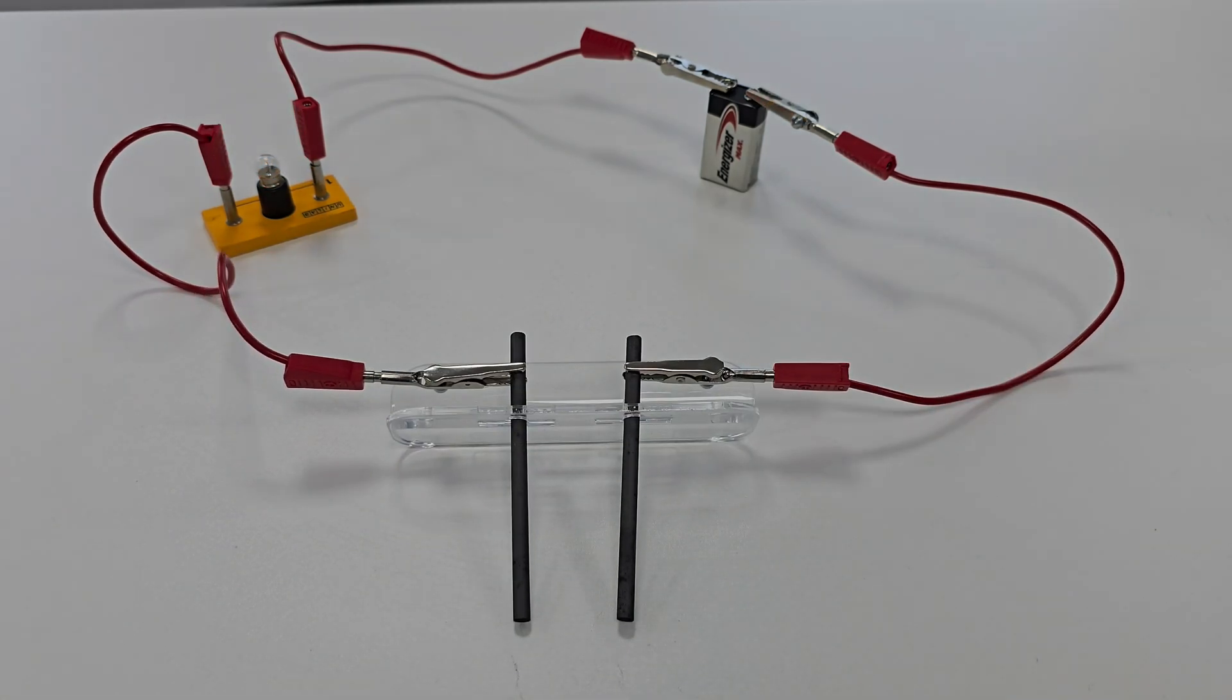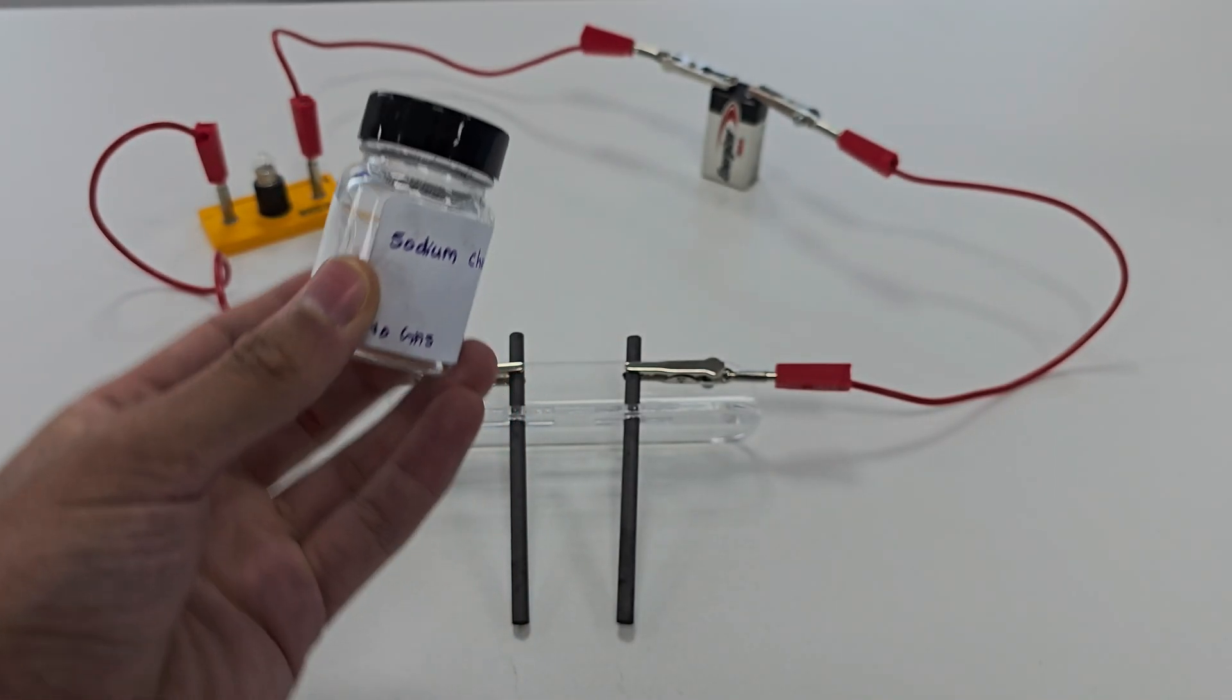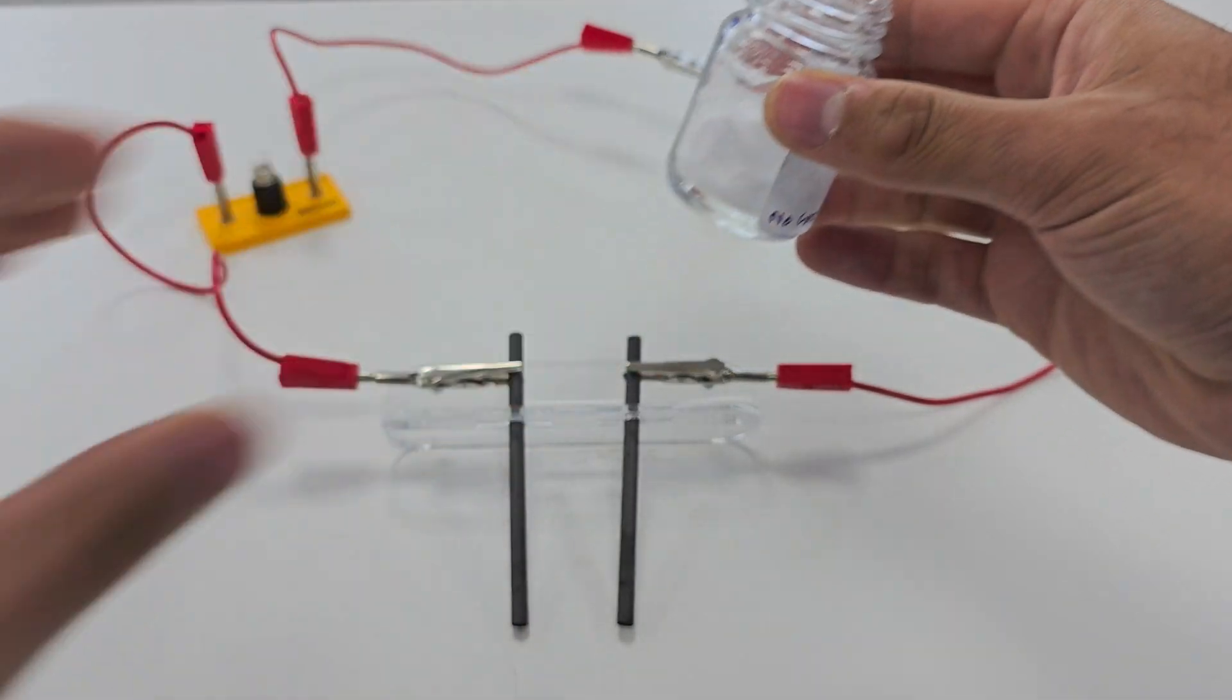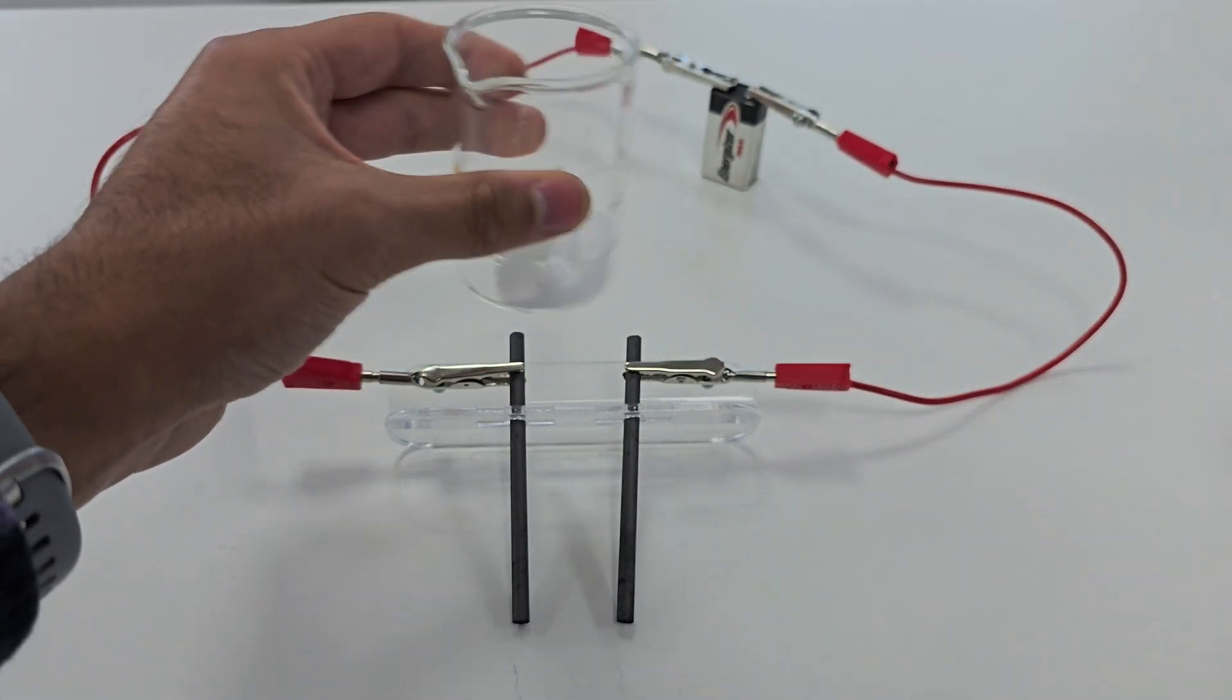Now let's test solid sodium chloride, commonly known as table salt. Ionic compounds are made up of positively and negatively charged ions held together in a strong lattice. In the solid state these ions are fixed in place and cannot move freely.